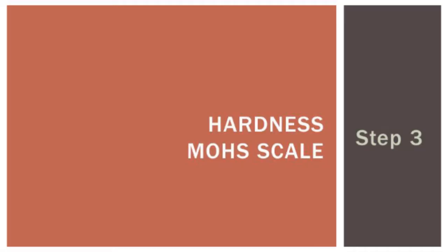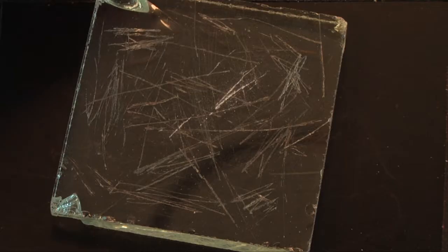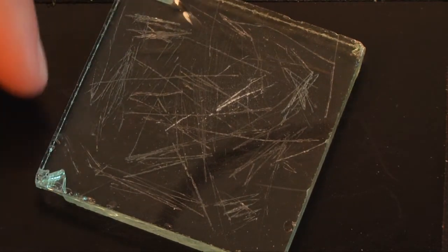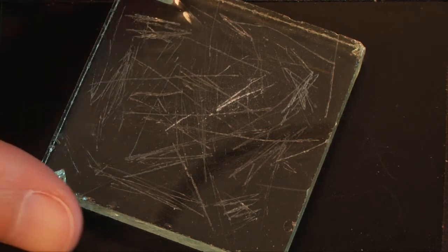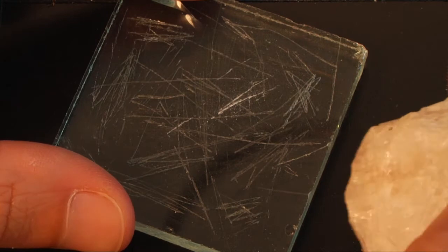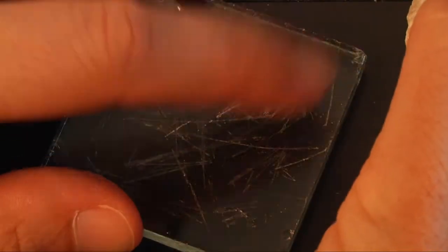The next property that you'll test for is hardness. And you'll use a glass plate like the one you see here. You can see there's lots of scratches on here. So you'll place it flat on the table, hold it with a few hands, and then take your mineral and try to scratch the glass with it. And then you'll see that you scratched the glass, so harder than glass.